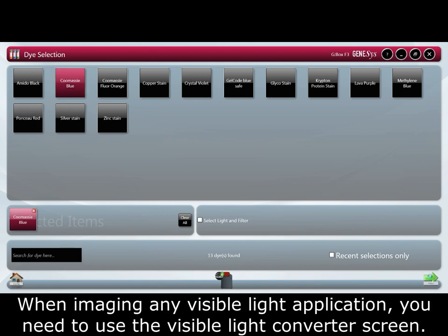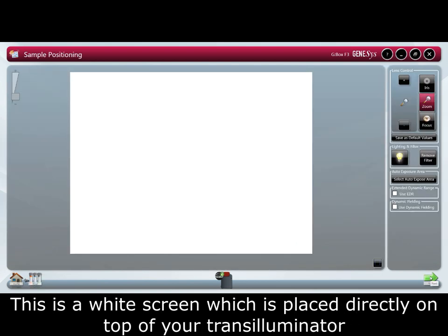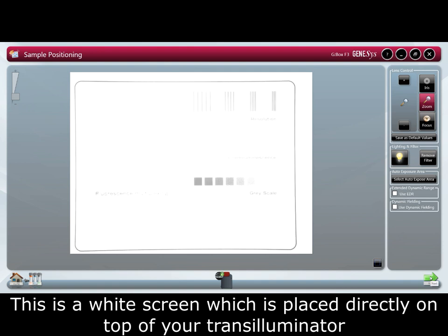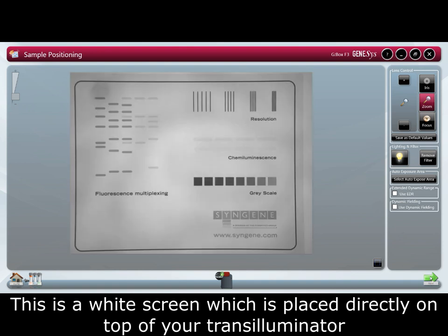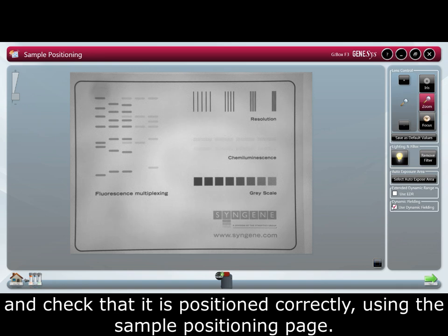When imaging any visible light application, you need to use the visible light converter screen. This is a white screen which is placed directly on top of your transilluminator. Once all the parameters have been set, place your gel on top of the transilluminator and check it is positioned correctly using the sample positioning page.